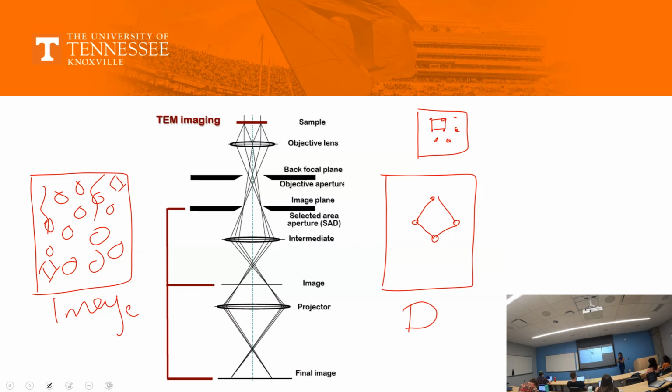My point is, the minute you get this image, you select the D, and suddenly you start seeing these patterns here. And these patterns are characteristic of what? Maybe the pattern is in a hexagon way. It's not really a hexagon, it's square distributed. Or you can have a proper square here. So what do you interpret from this image? I want to know what your initial thoughts are.